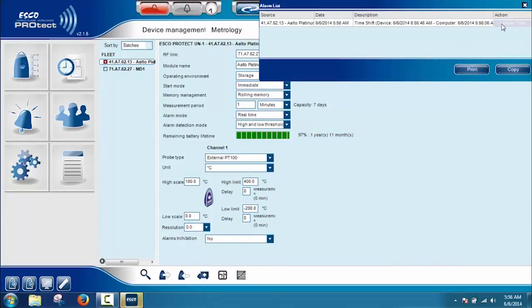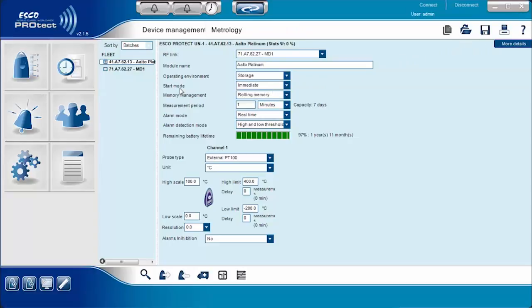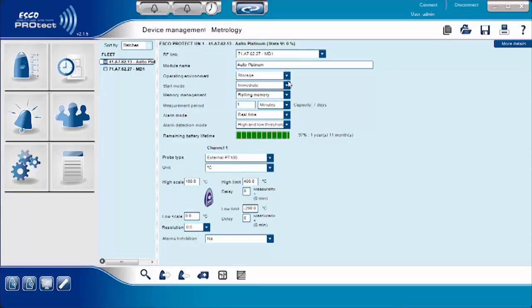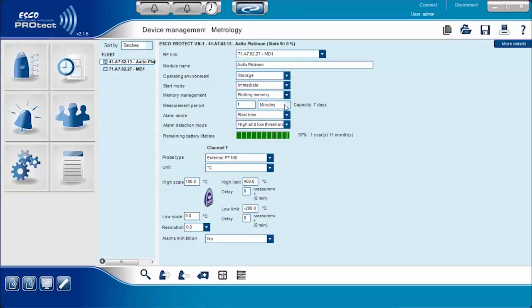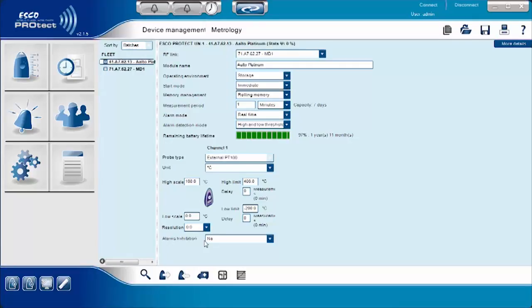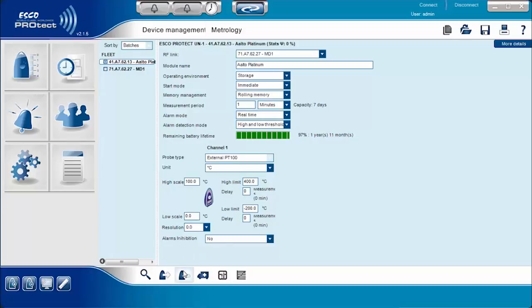Once the ESCO PROtect device is selected, the user needs to define different parameters such as module name, operating environment, start mode, memory management, measurement period, alarm modes, high and low temperature alarm, high and low scale temperature, and alarm inhibition. After selecting device parameters, users should confirm all changes by selecting the Apply Configuration icon.